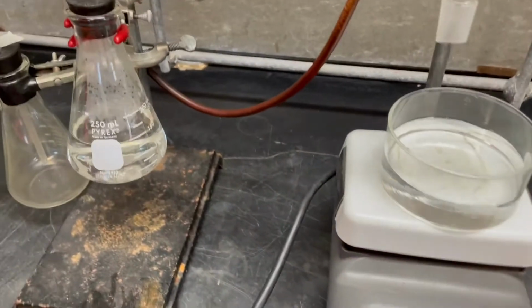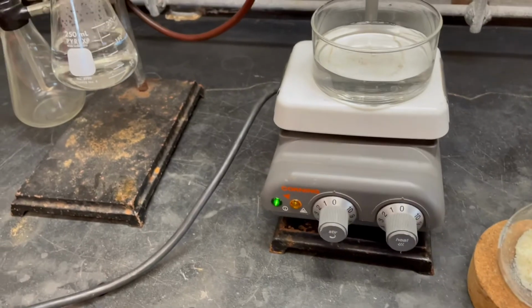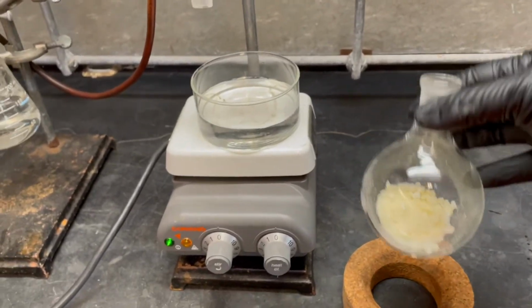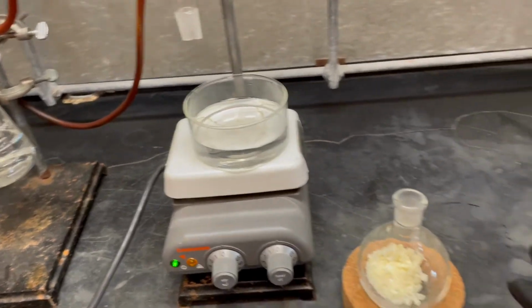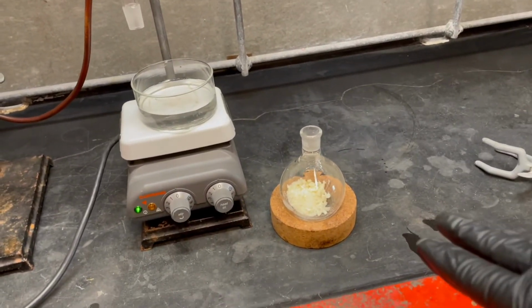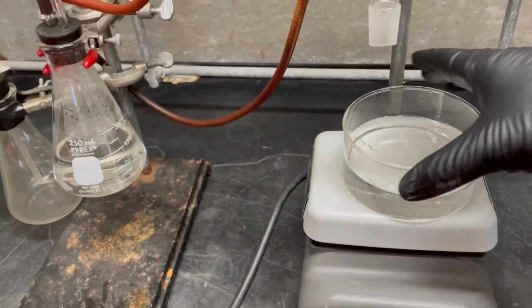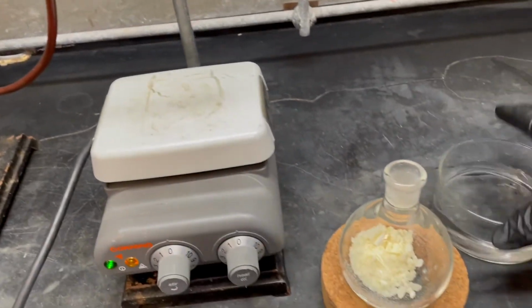I don't have the heat on yet because I want to make sure that I add my 25 mils of nitric acid to this first, because sometimes it gets a little crazy. It needs to simmer down a minute before you start heating that bad boy up. But that's why I don't have this heating up.